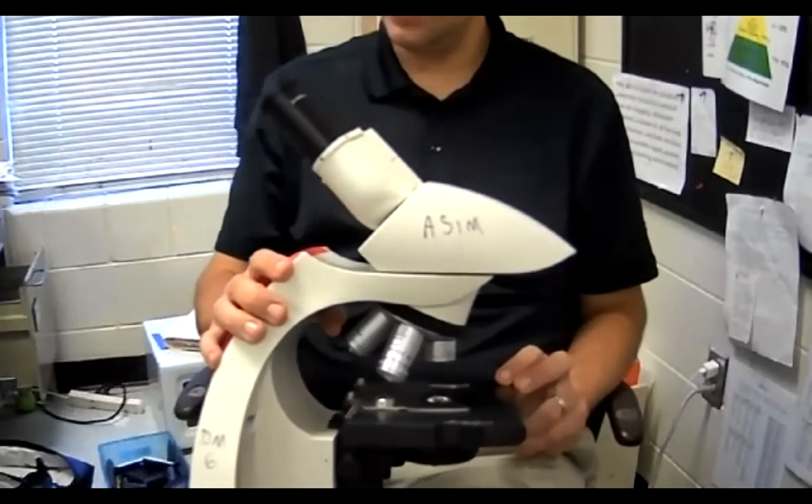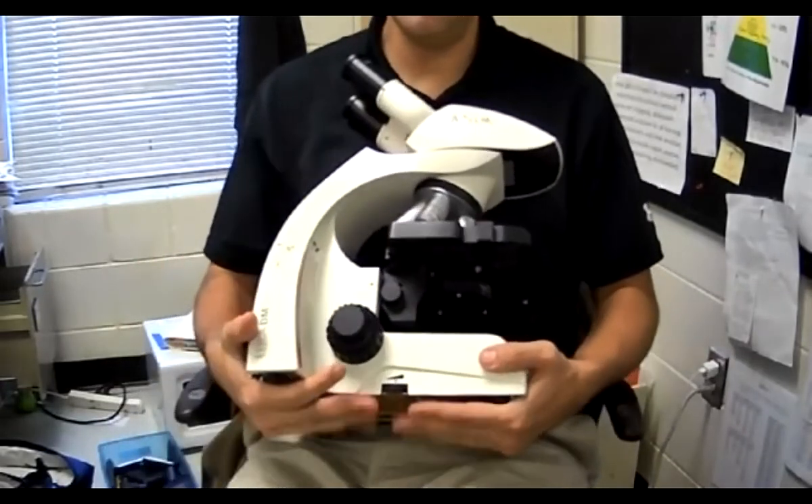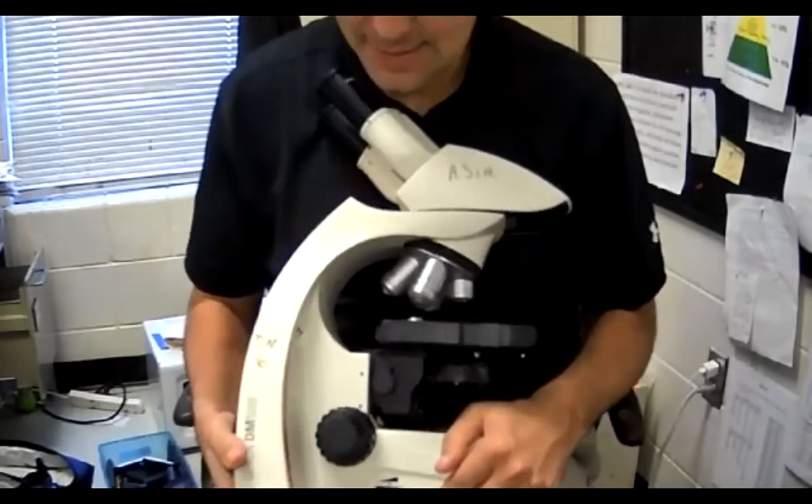The next thing right here at the bottom — the very bottom — is the base. The bottom is the base.